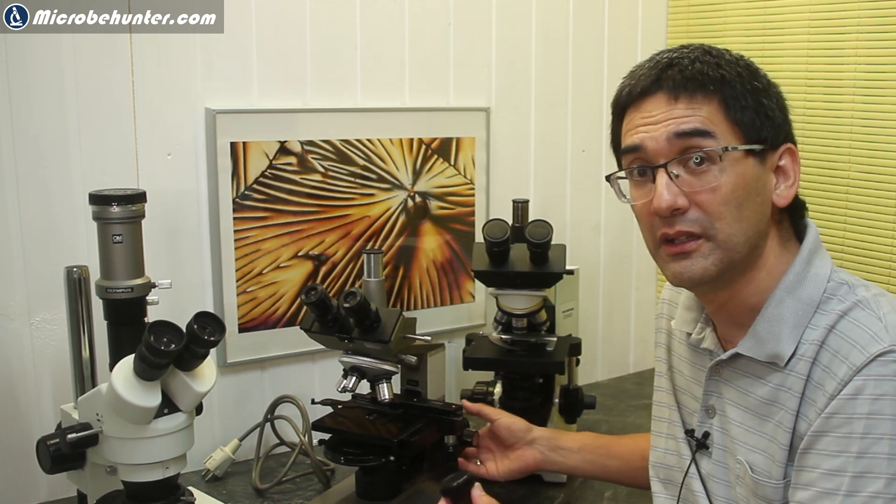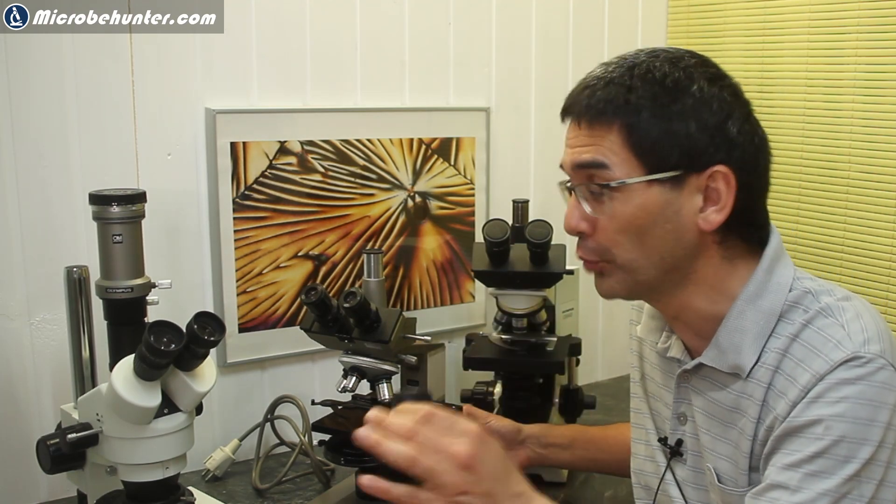So in short, it is possible. It might not always be the best idea. You have to try it out. It is experimental. So this is concerning the size issues and mechanical issues here. Check that you're indeed able to physically mount a larger objective in your microscope. I know it's a little bit unfortunate that we are now with all of those standards that are around, it's not always quite easy to get an overview.